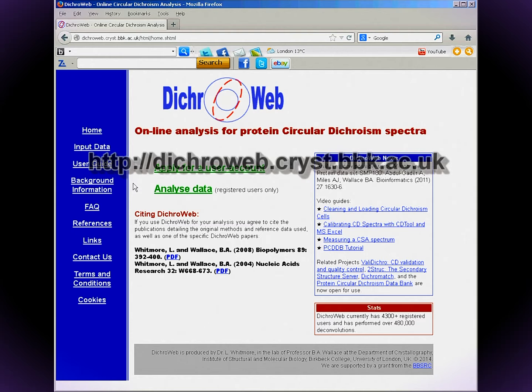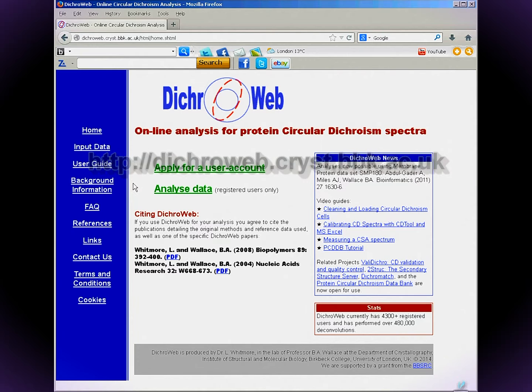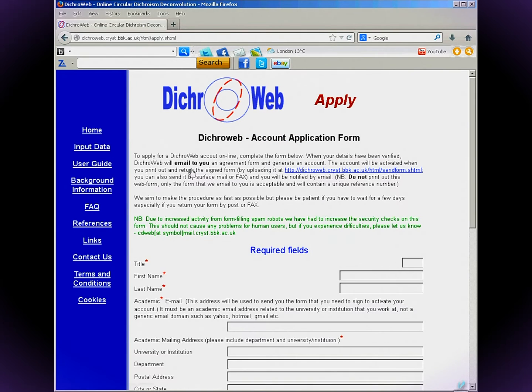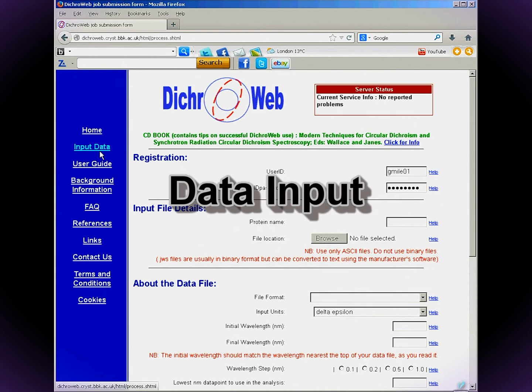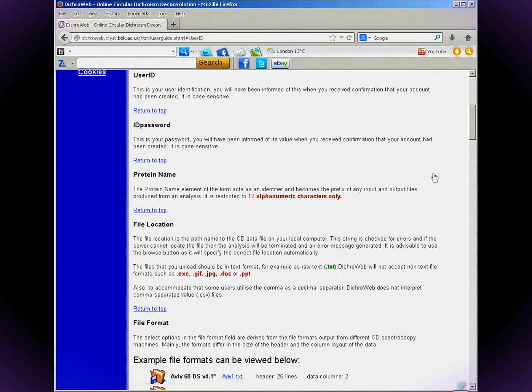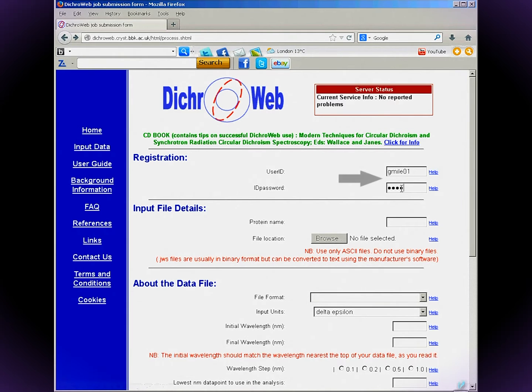DichroWeb can be found at dichroweb.cryst.bbk.ac.uk — just Google 'DichroWeb'. You'll need an account and password; apply online and complete the form. Follow the instructions. Now we'll look at inputting data. Note that clicking 'Help' next to each input box will direct you to the relevant page in the help section. Enter your username and password and enter a protein name.